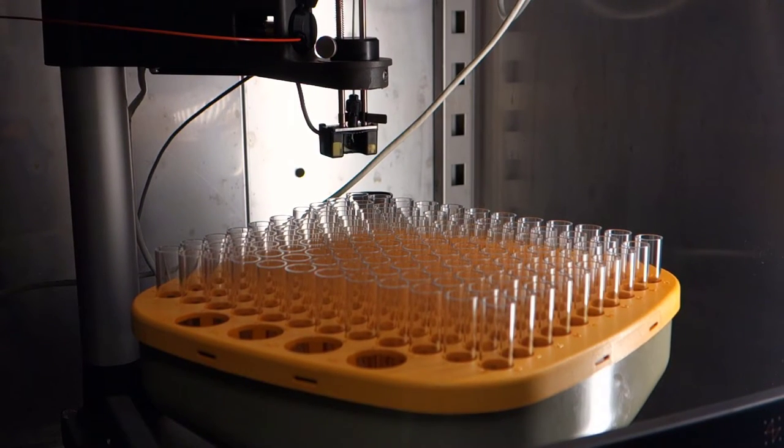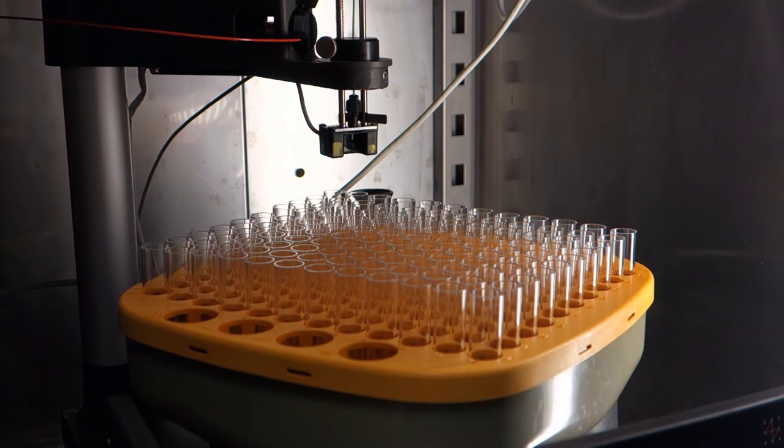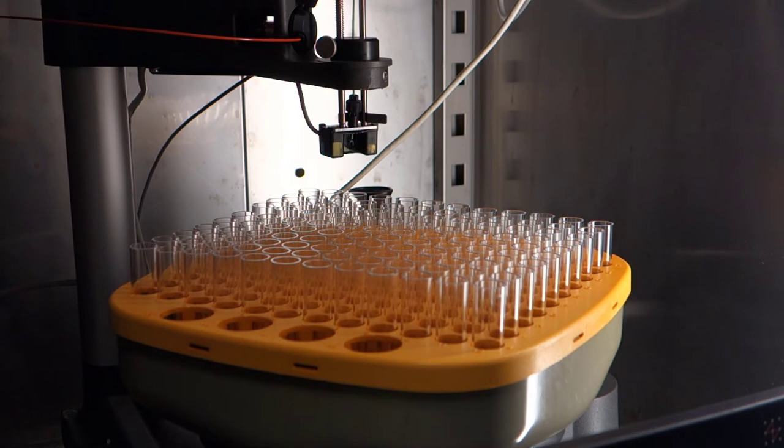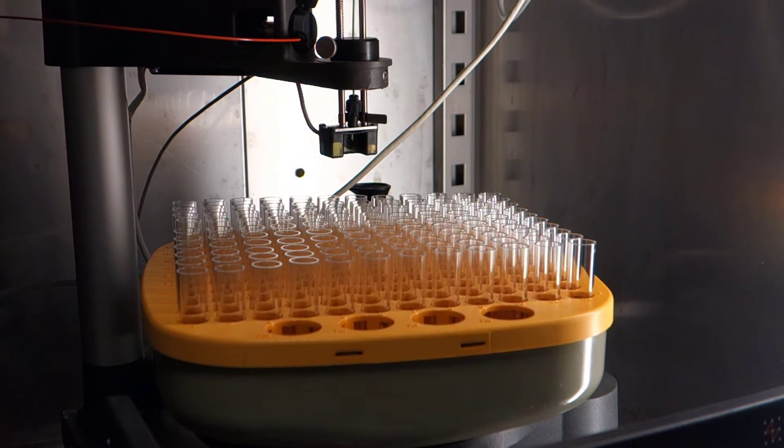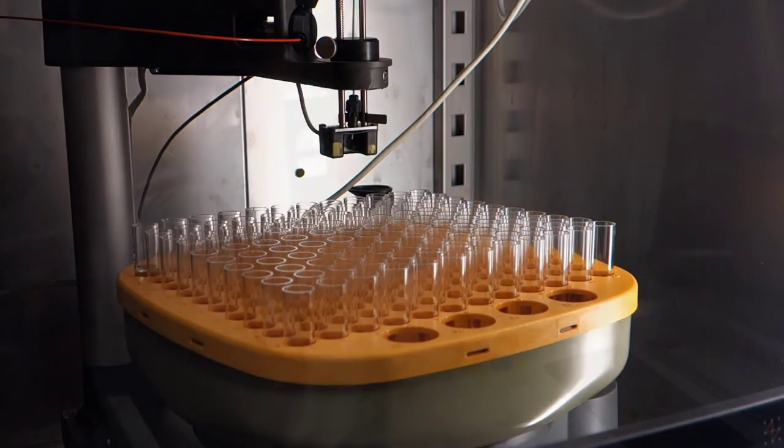In the next step, we cleave out the His tag and run the protein to the column again. And this time, your cleaved protein will be in the flow-through. In addition to purification in a nickel column, there are many other kinds of columns that can be used for different purposes.